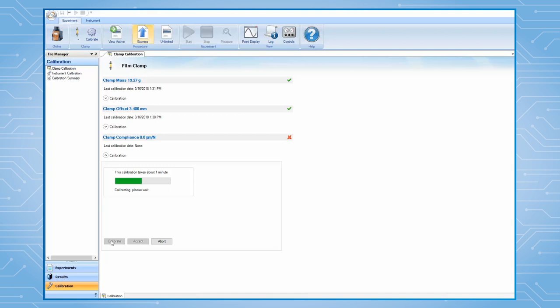If the calibration is finished normally, the compliance value should typically be lower than 0.5 micrometers per newton. Click on Accept to finish the calibration.